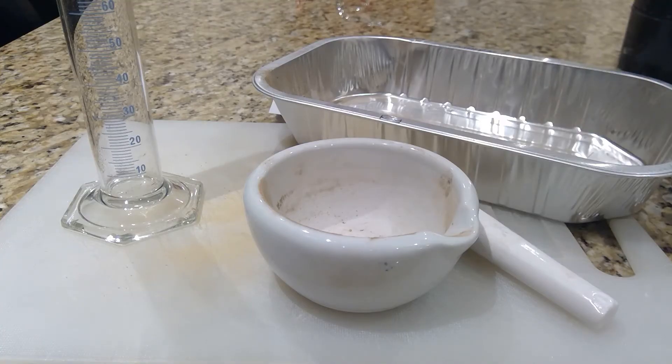Today we're going to determine the soil texture of a soil sample using the sedimentation method. Previously I would have done soil texture using the hand testing method and the soil sieve method, and this gives you more quantitative results.